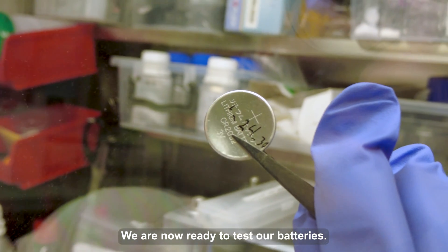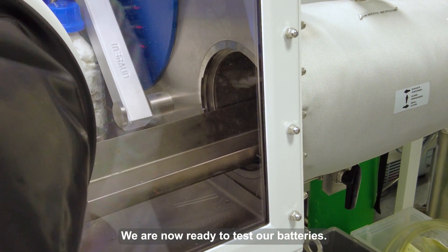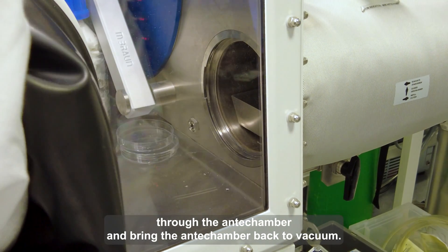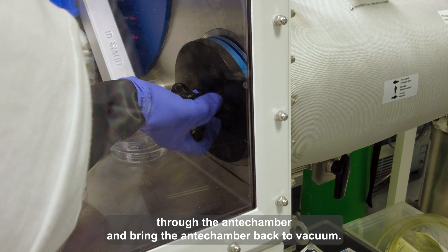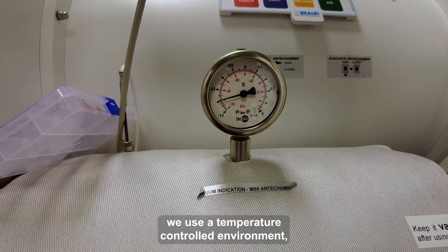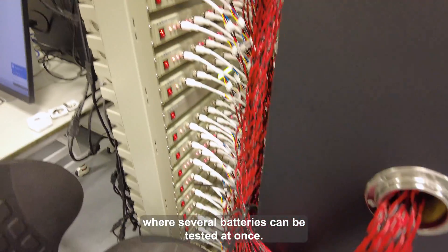We are now ready to test our batteries, but first we need to take them out of the glove box through the antechamber, and bring the antechamber back to vacuum. To test the battery, we use a temperature-controlled environment where several batteries can be tested at once.